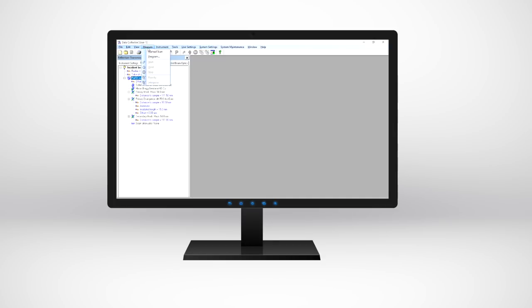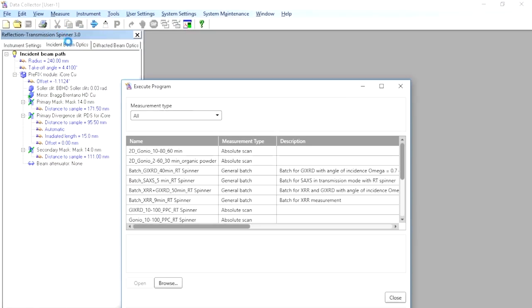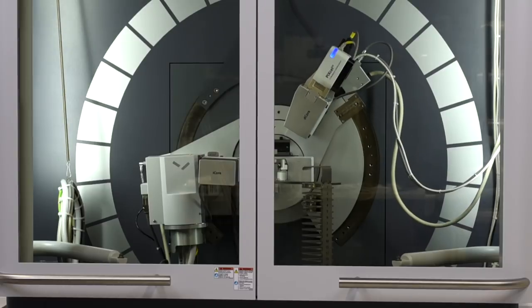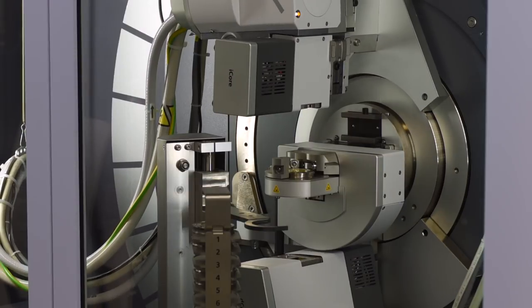A large set of template measurement programs for the various applications has been defined to decrease the complexity for the user. These templates can either be used without changes or they can be modified to satisfy different requirements.